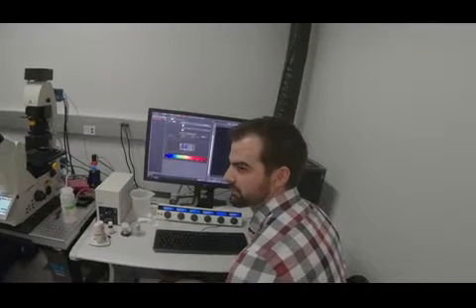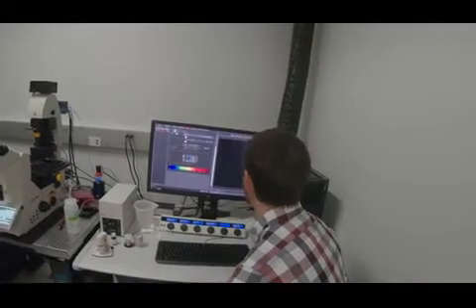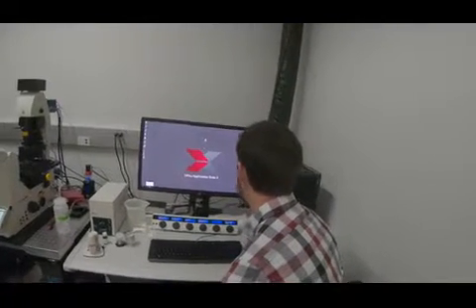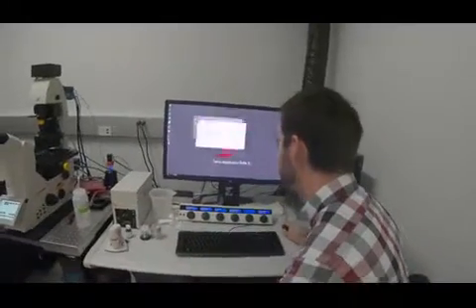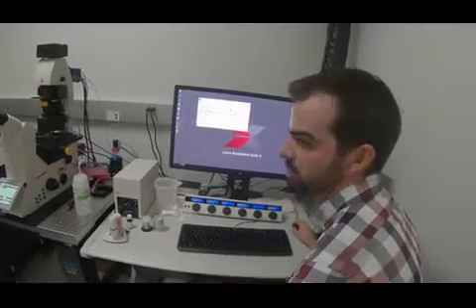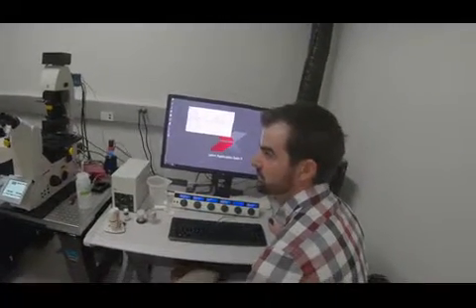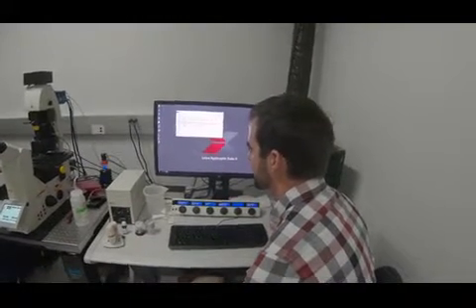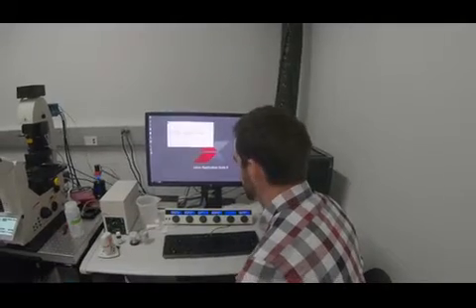Light sheet doesn't care about data. So how big are the drives, so we know how much we can put on there before we have to worry about space? They're big, but as always, I recommend backing up your data so it's not in one place. The data drive is 11 terabytes, and it's a RAID 5 array, so it has data redundancy.